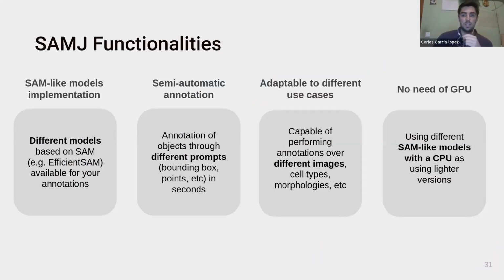These are the SAMJ functionalities, the functionalities of the plugin. But in my opinion, I shouldn't even need to explain this. In the end, this is a really user-friendly plugin that you should be able to use with a couple of clicks. There's no need to learn the theory or anything like that.